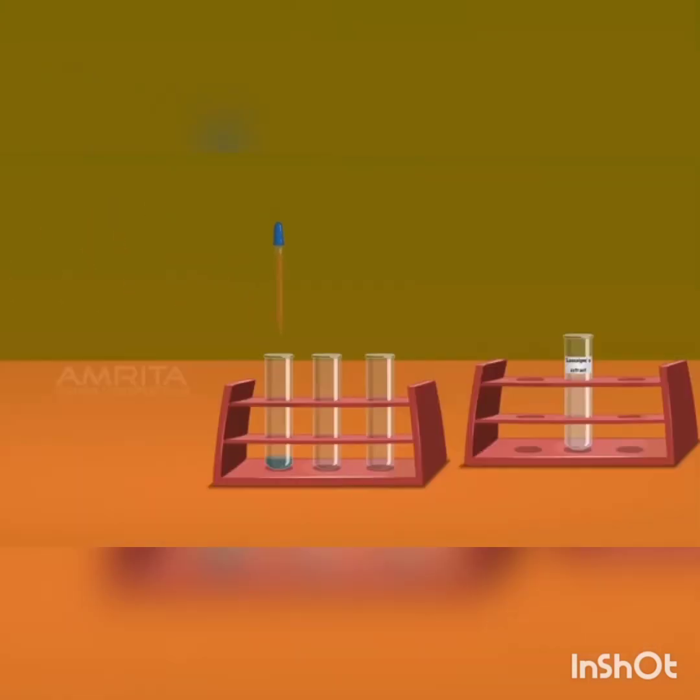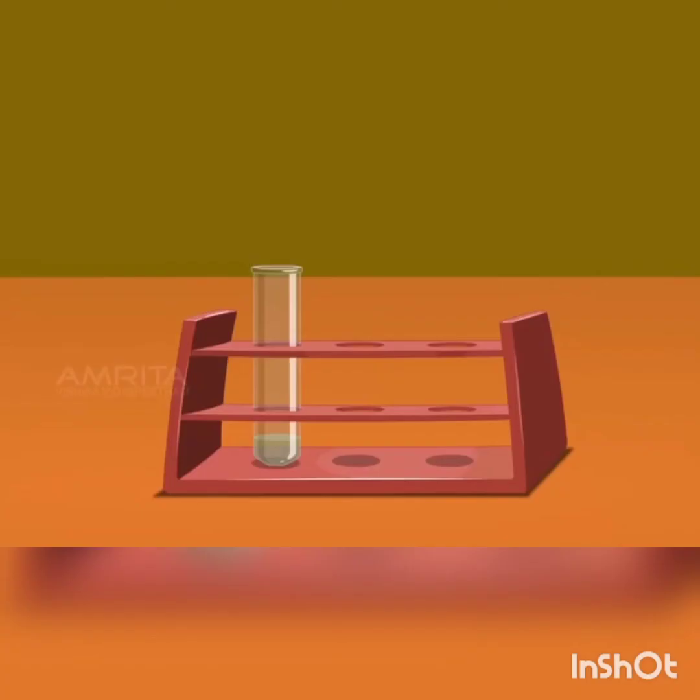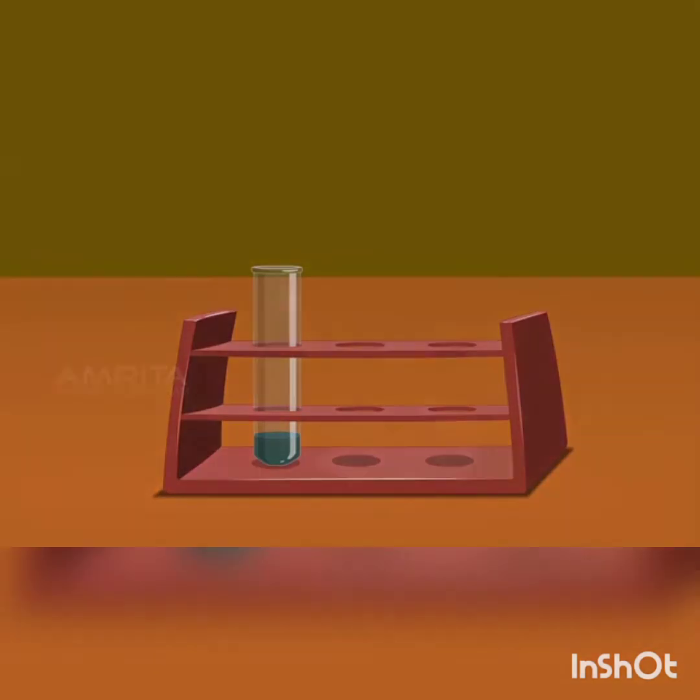Add ferric chloride solution into the contents of the test tube. Using another dropper, take a small amount of concentrated hydrochloric acid. Add concentrated hydrochloric acid into the contents of the test tube. On further treating with ferric chloride and concentrated hydrochloric acid, sodium ferrocyanide forms a Prussian blue complex, ferric ferrocyanide.